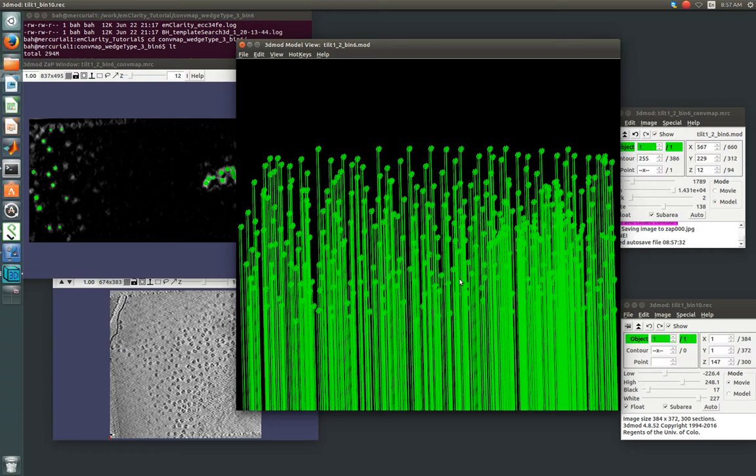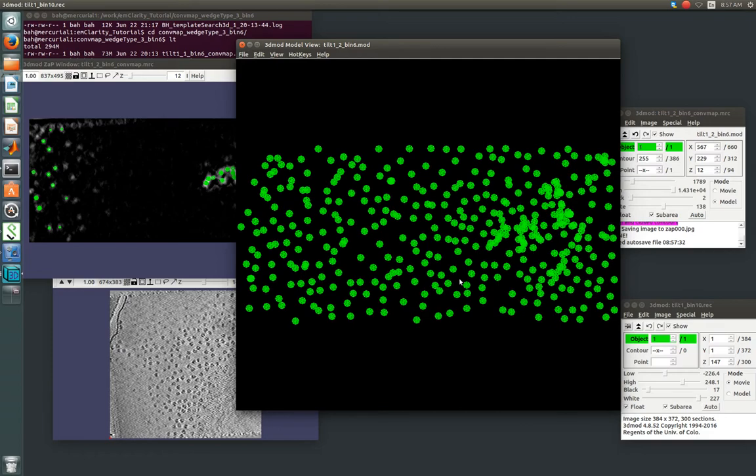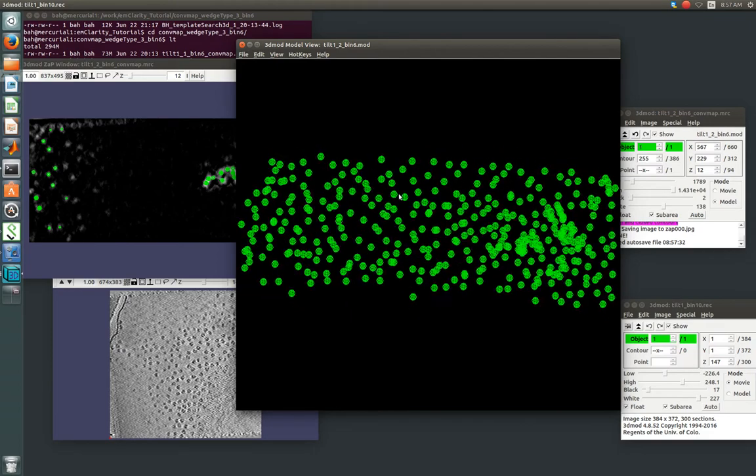So, if you turn off the vertex buffers, hitting CTRL, SHIFT, and V, it's a little lower quality image, but then it gets rid of that weird streakiness.